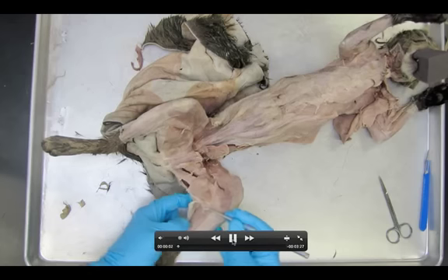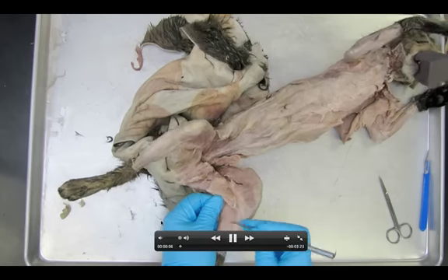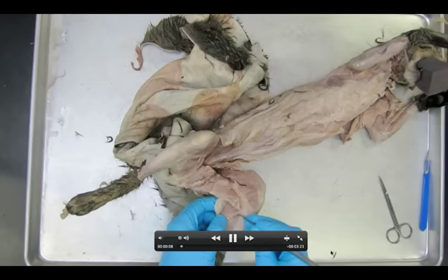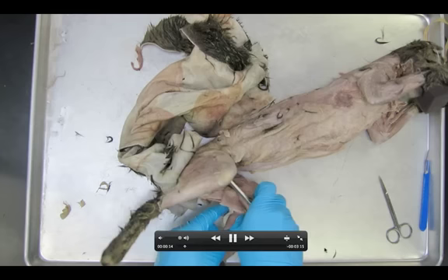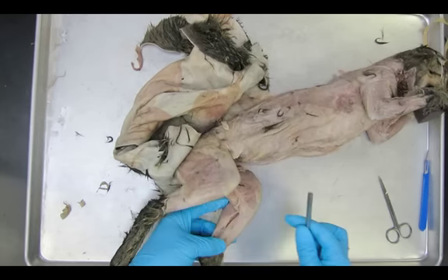Alright, so we're back and we're still cleaning off the fascia. I can see the gastrocnemius. Notice how I'm getting underneath the gastrocnemius — pretty big muscle, very large.